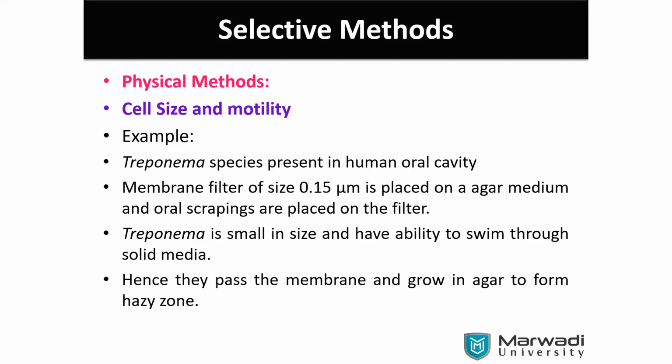Now put that on the microscope. Only motile cells you will observe, they start to swim. Some particular organisms have high motility, some are very low, so you can very easily observe. This is called the hanging drop, where the drop is hanging on the cover slip.